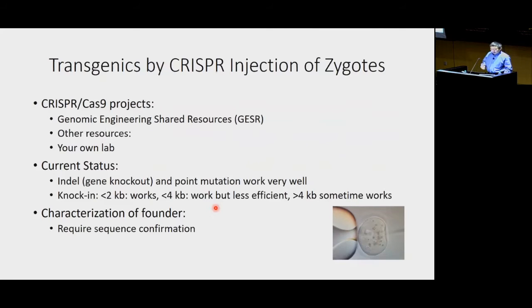When we make a large knock-in, we usually use double-strand DNA. There are several different ways nowadays. And the best way, I think, is we will have an initial meeting, me, and I collaborate with the Genome Engineering Shared Resource. There's also a coordinator, Brian.